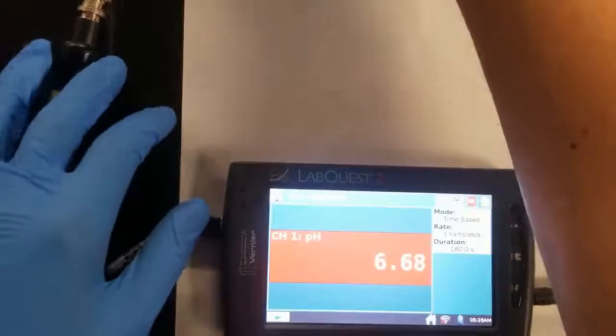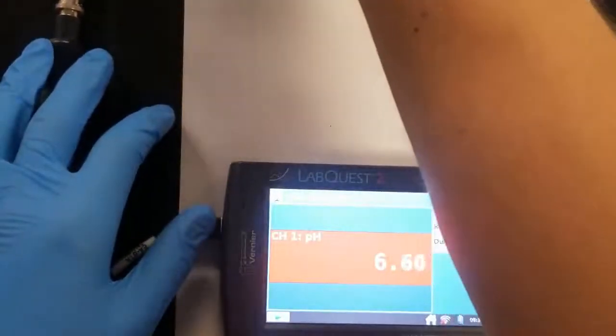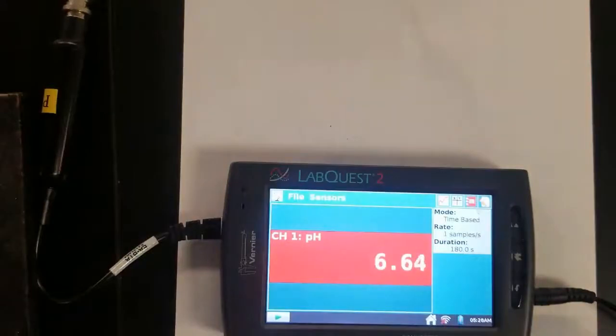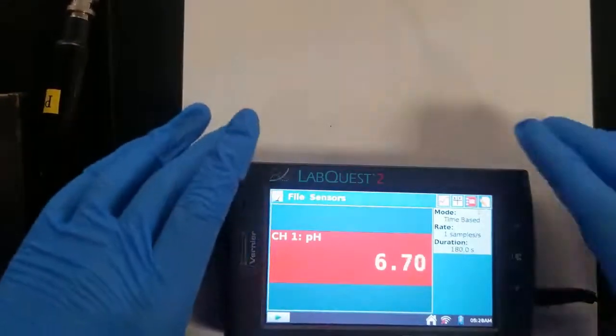But before we can do that, we have to calibrate the instrument. The instrument can read these numbers, but it doesn't know what is what. So you have to tell it, this is pH 2, this is pH 10, whatever, and then it'll learn it, right? And then you can do whatever you want, right?